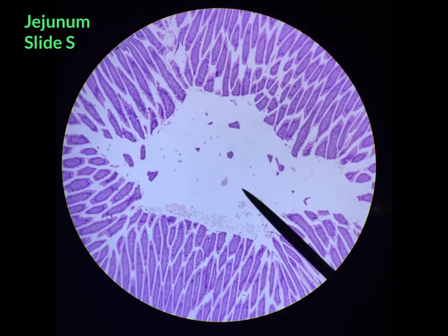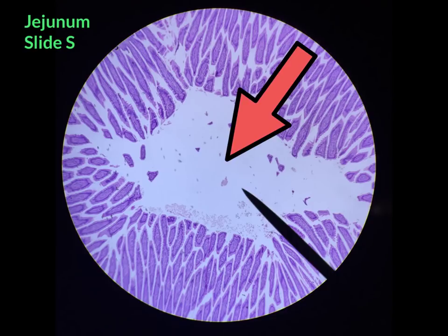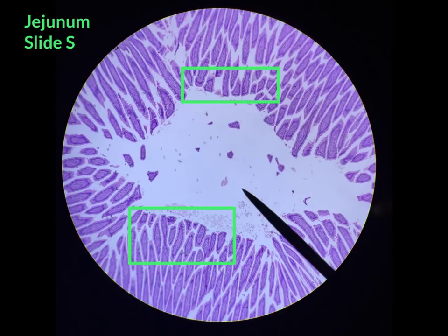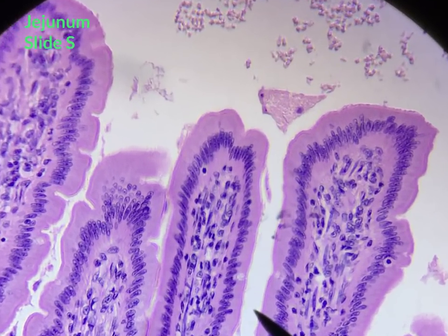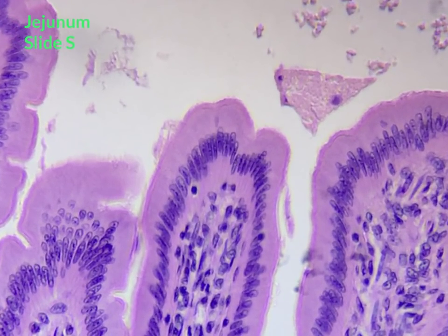Next, we are going to take a look at simple columnar epithelial tissue, which can be found in the jejunum on slide S. The big open white space in the center is the lumen — the passageway for food. The purple area is where you will focus to find simple columnar epithelial tissue. Under high power, we can see the rectangular-shaped cells of simple columnar epithelial tissue, shown here.